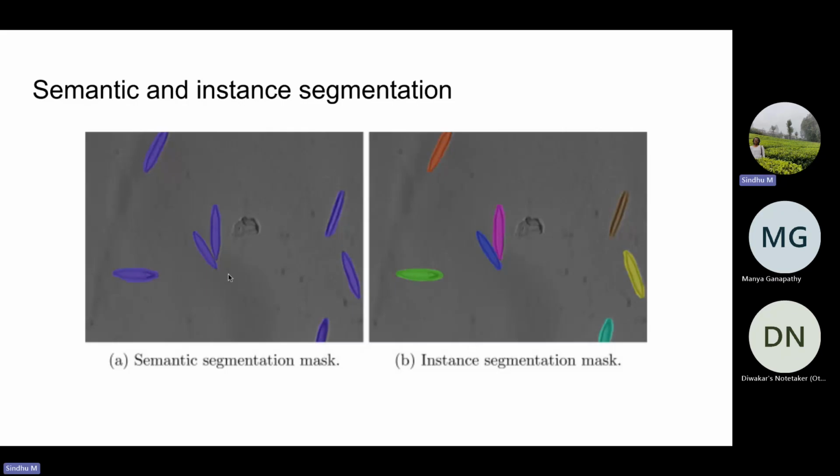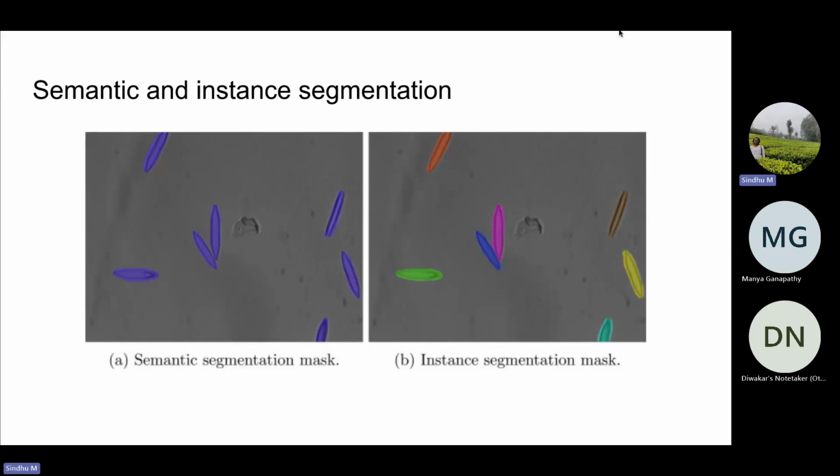If you just want to get the background without any particles, then this first approach may be useful. It is also simpler. But if you want to characterize, say, the shape of the cells, which is typically what we want in biological images, then instance segmentation is more helpful.